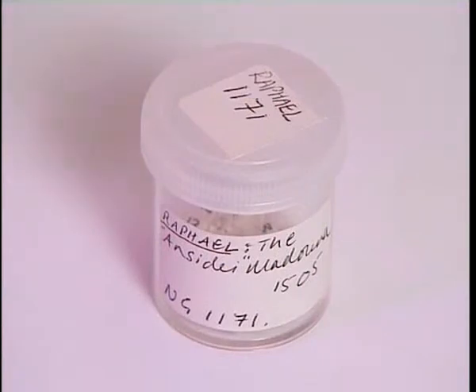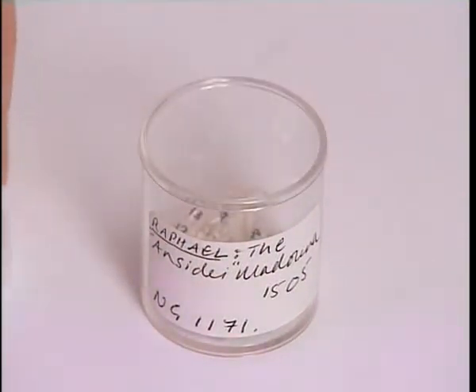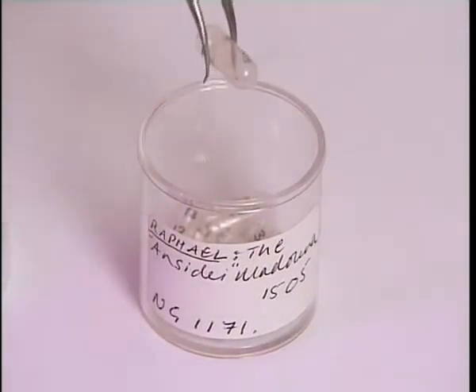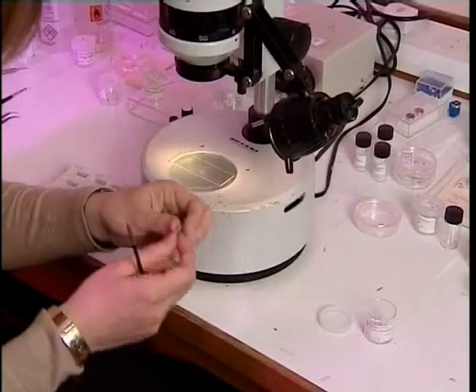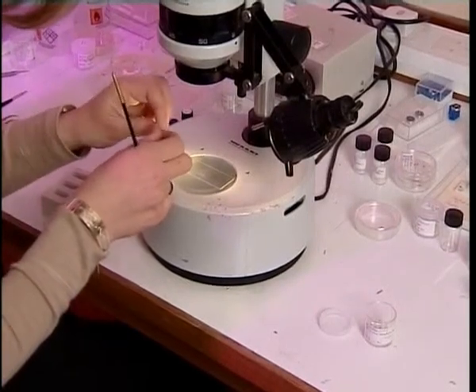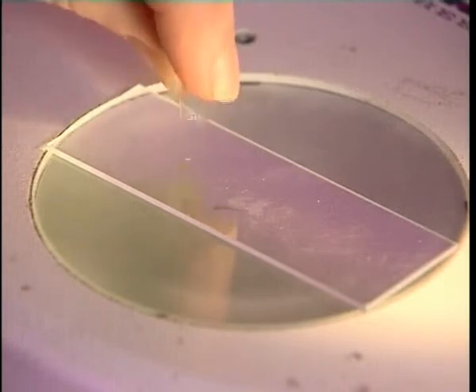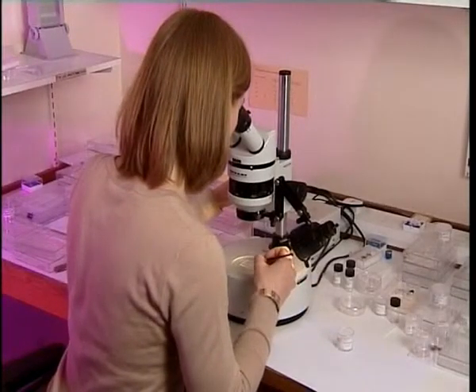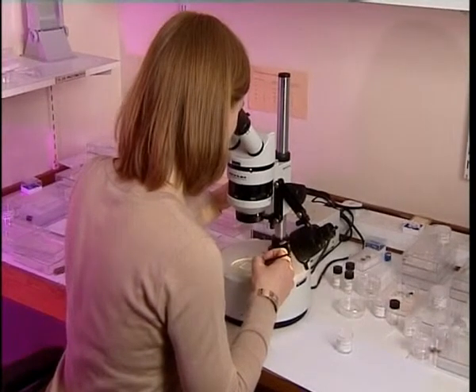These are the samples from the painting by Raphael, and each tiny flake of paint is in a separate gelatin capsule. This one here is the one from the grey paint of the architecture. I'm going to put this sample onto a microscope slide and look at it under this low-powered microscope to decide how I'm going to mount it and which orientation I'm going to use.